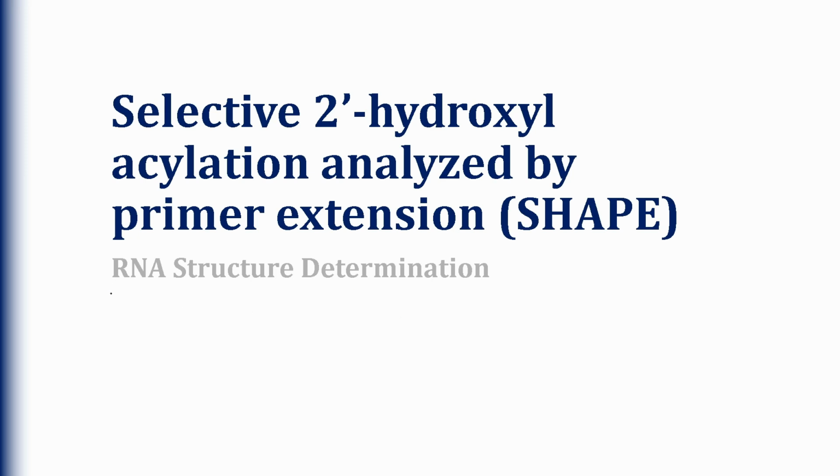Hello and welcome to this discussion on SHAPE, or selective 2'-hydroxyl acylation analyzed by primer extension, or SHAPE for short. SHAPE is utilized for RNA structure determination. We use SHAPE to determine the RNA structure of a given molecule of interest.